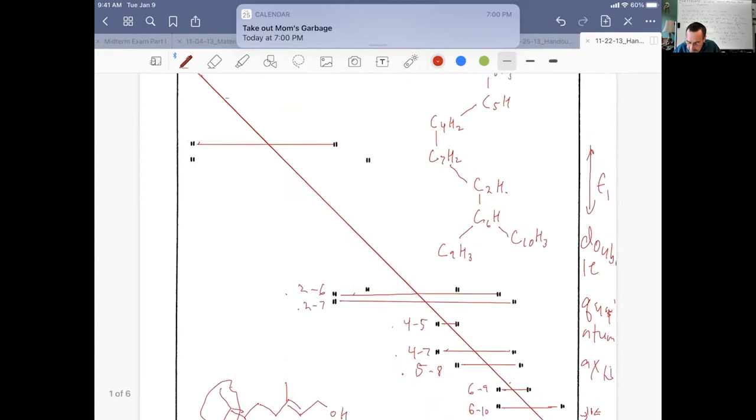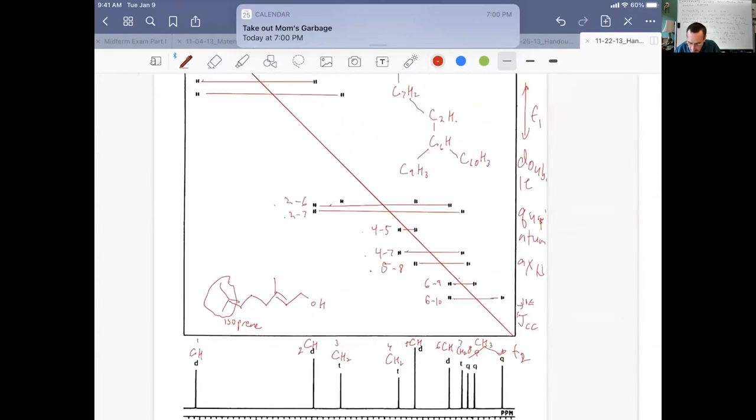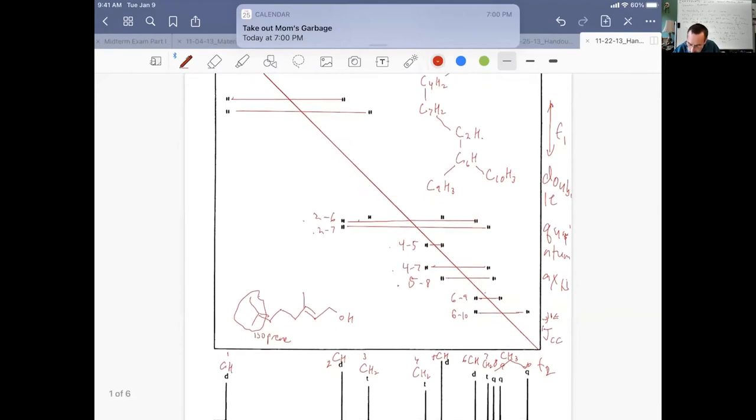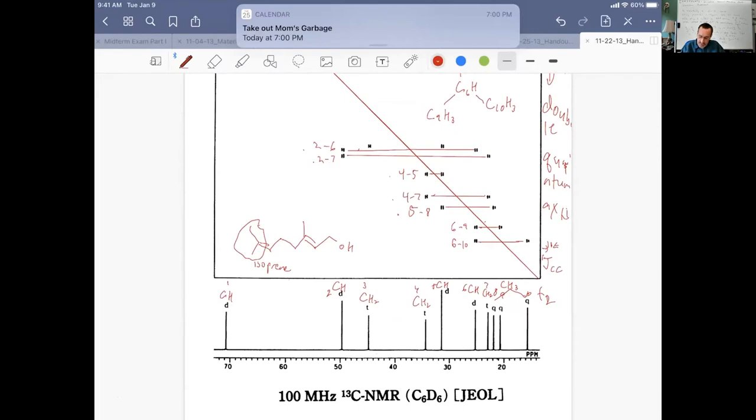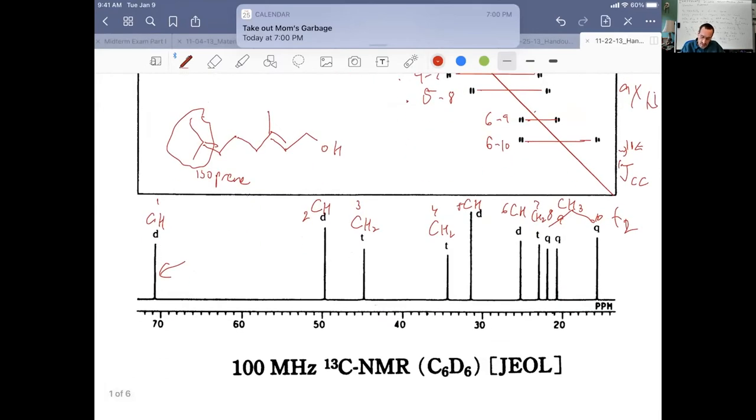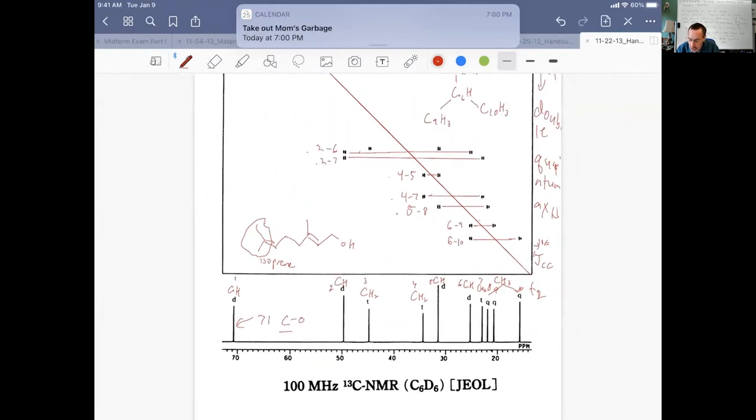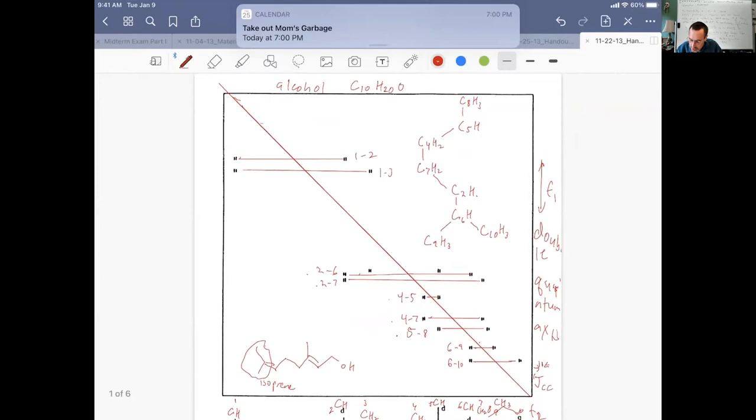Where do we go from here? I've used my 5 to 8, my 4 to 7, my 4 to 5, my 2 to 7, my 2 to 6. So I guess I better get some more peaks here. And we come to some cross peaks off of 2 and 3. This one I had identified before was carbon 1 to 2, and this is carbon 1 to 3. I said I have an alcohol. Now I always urge you to pay attention to chemical shifts. Look at the chemical shift of carbon number 1. It's at 71 ppm.